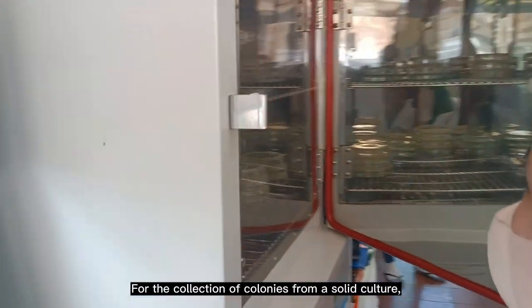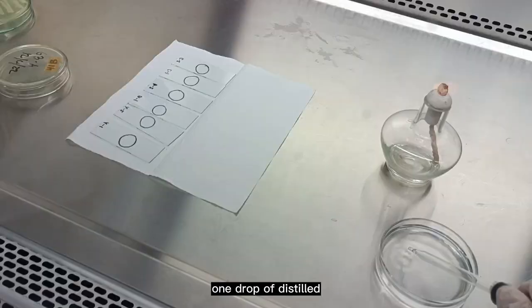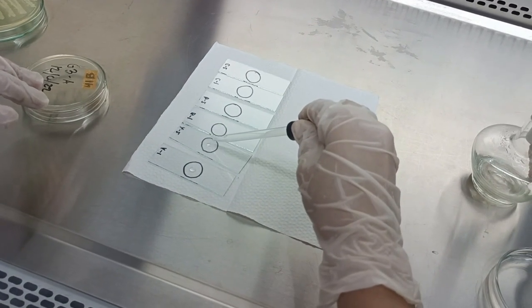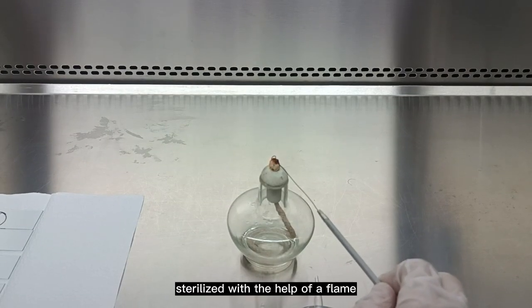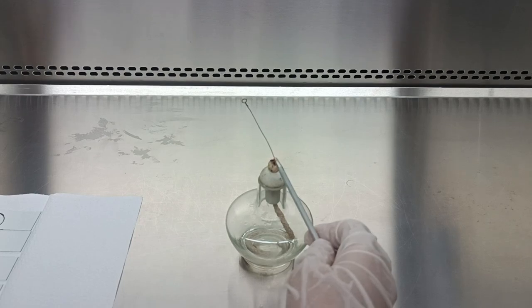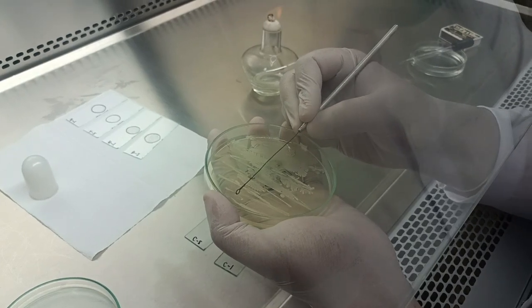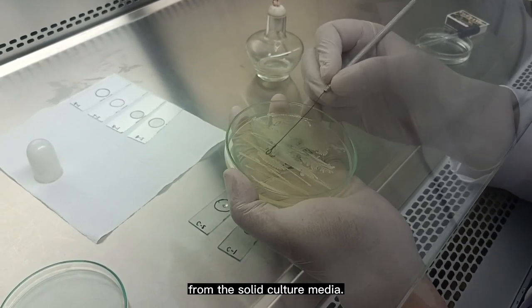For the collection of colonies from a solid culture, 1 drop of distilled water was placed in the glass slide. The inoculating loop was sterilized with the help of a flame from the alcohol lamp. After a few seconds, the inoculating loop was used to inoculate a single colony from the solid culture media.